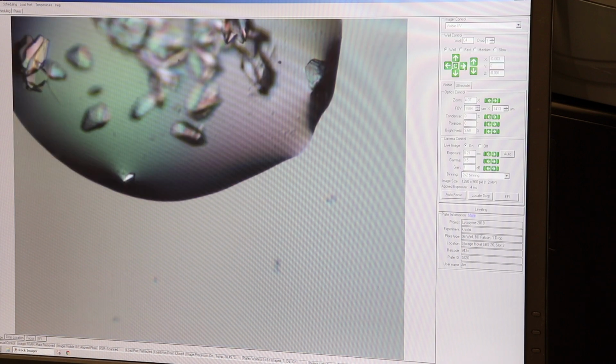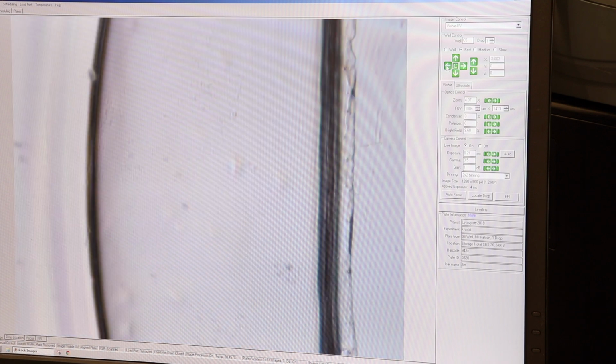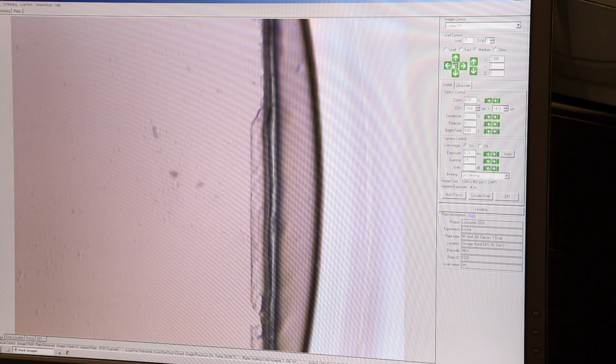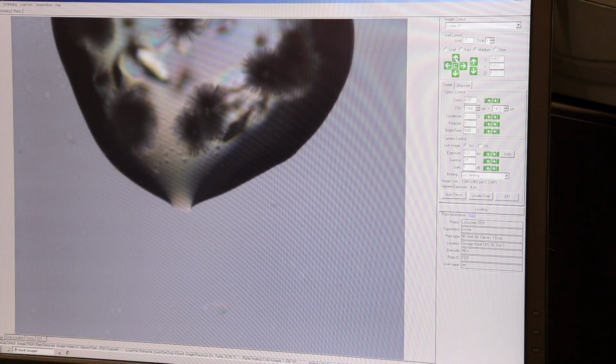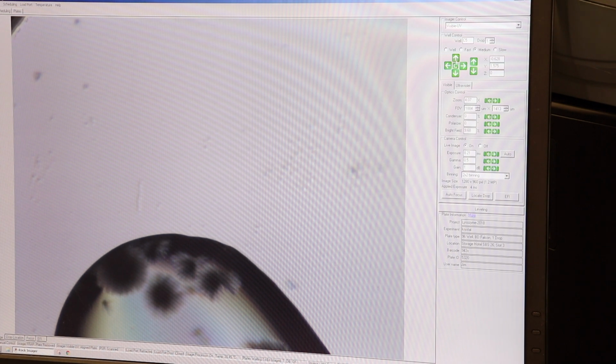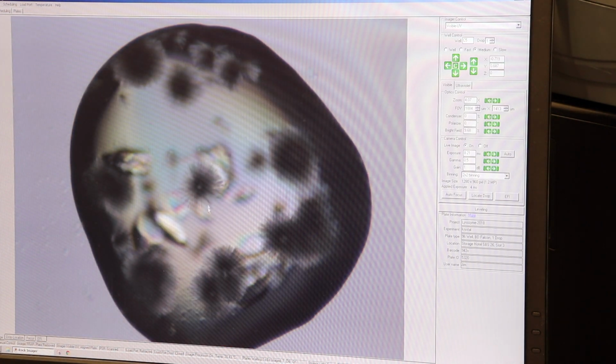Oops. We take it off of well and put it on fast. That'll move it. You can also use medium. To find the drop, an easier way also is to simply double click where you want to center, and that'll center it.